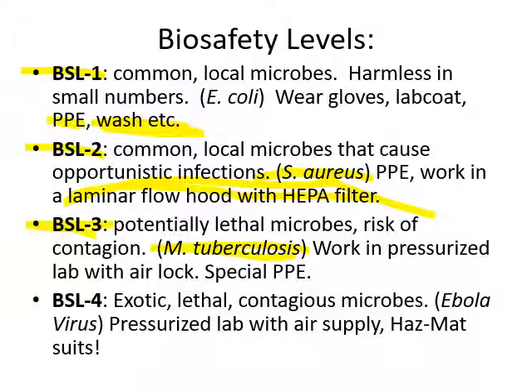So typically a BSL-3 lab is a special lab where you put on special protective equipment: a hairnet, a special disposable lab coat, gloves, a mask, and goggles. The lab itself has a negative air pressure so that under no circumstances is air leaking from the lab to the outside, but air from the outside is leaking into the lab. And that air, before it gets to go out again, is filtered through a HEPA filter before it goes out through an exhaust pipe in the roof. Okay, so that's a BSL-3 lab.